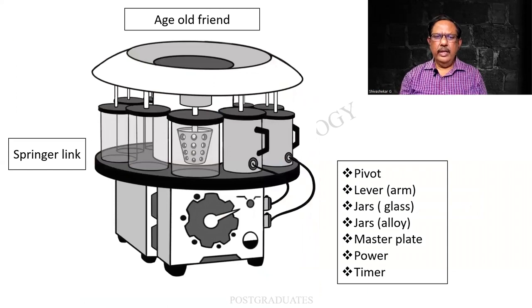So this is again beautifully explained, this kind of a diagram, very difficult for us to get. So I find that this is the thing covering the multiple lids. So you find that they are all snugly fit to prevent the evaporation. Centrally, there will be a pivot, and then there will be the radiating arms or the levers that are available.